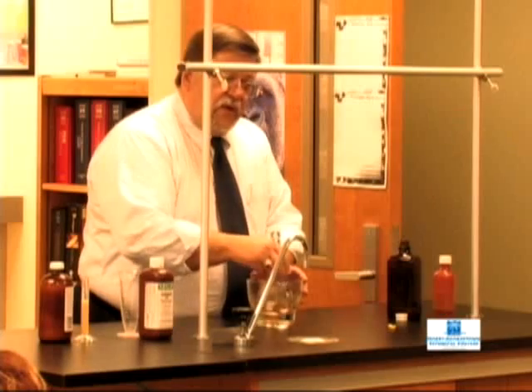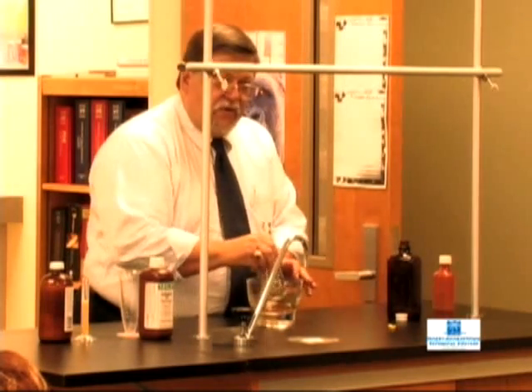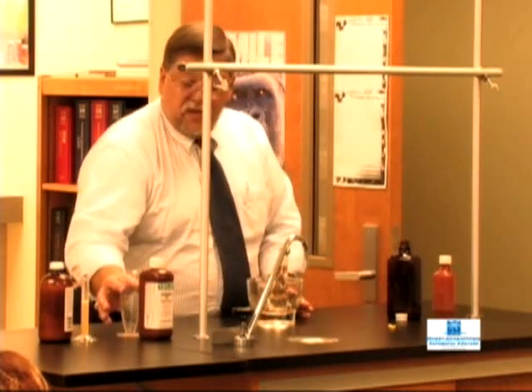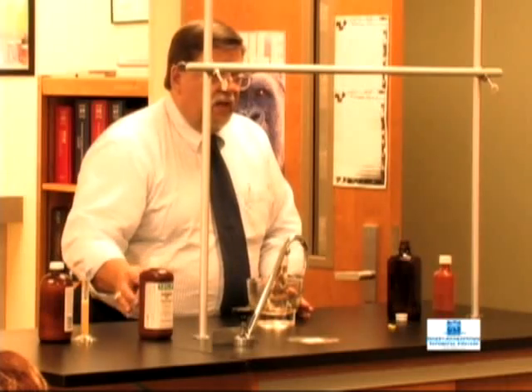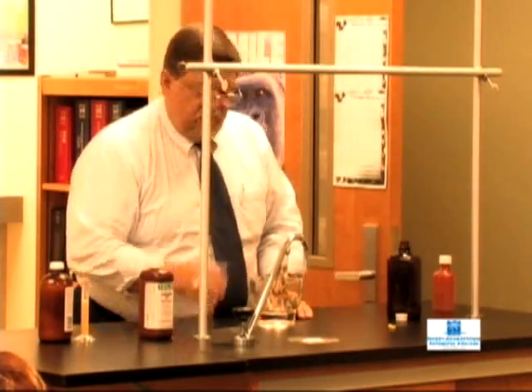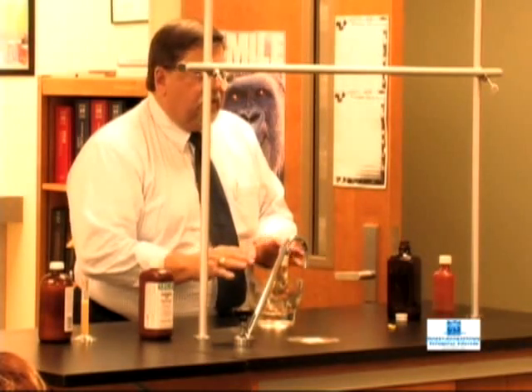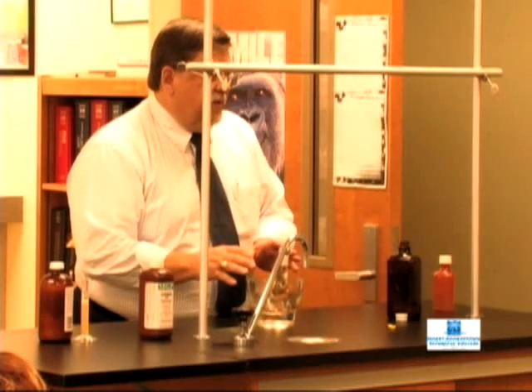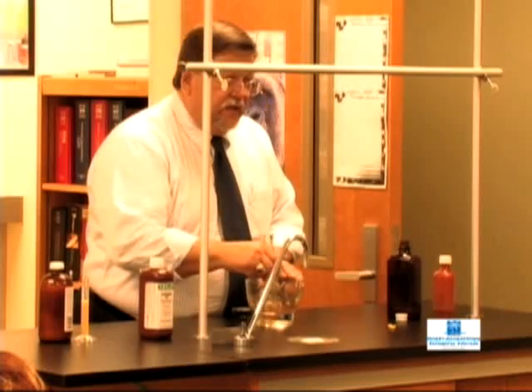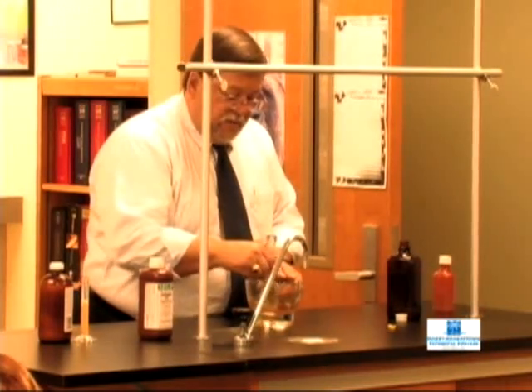And the reason we only start off with 20 mils is because of the action of doing this mixing. You can imagine if we would have used 100 or more mLs of this Benadryl, we'd have this flowing out all over the place. But when we have a very small amount, like 20 mils, which is just a little bit more than a tablespoon, chances are we're not going to make a mess, and we're still going to come out with the same thing that we wanted to.